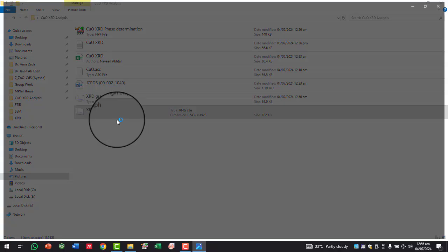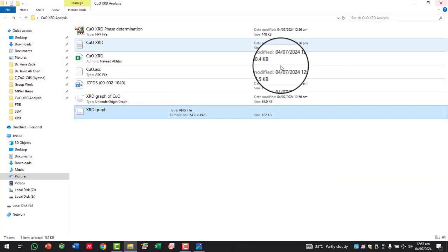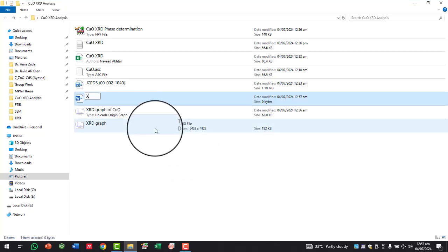Now you can simply copy this picture and paste it in the Word file where you have to discuss it.